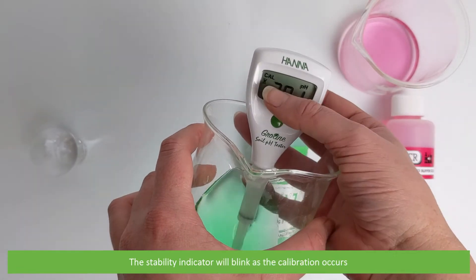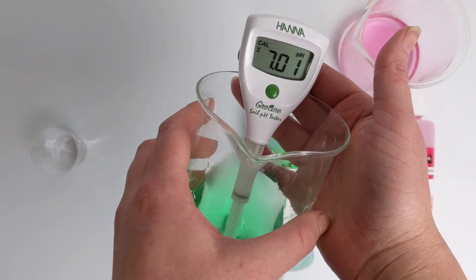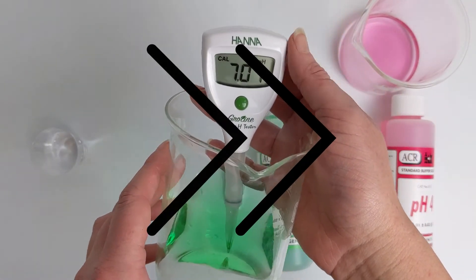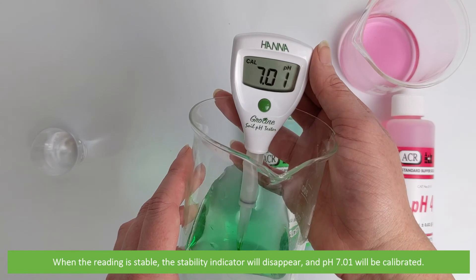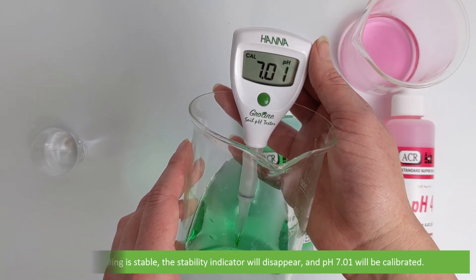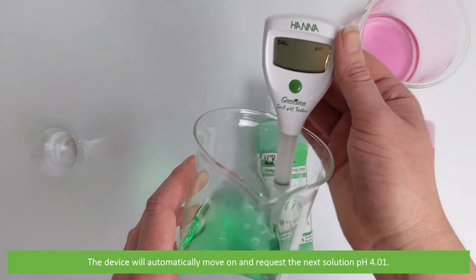The stability indicator will blink as the calibration occurs. When the reading is stable the stability indicator will disappear and pH 7.01 will be calibrated. The device will automatically move on and request the next solution of pH 4.01.